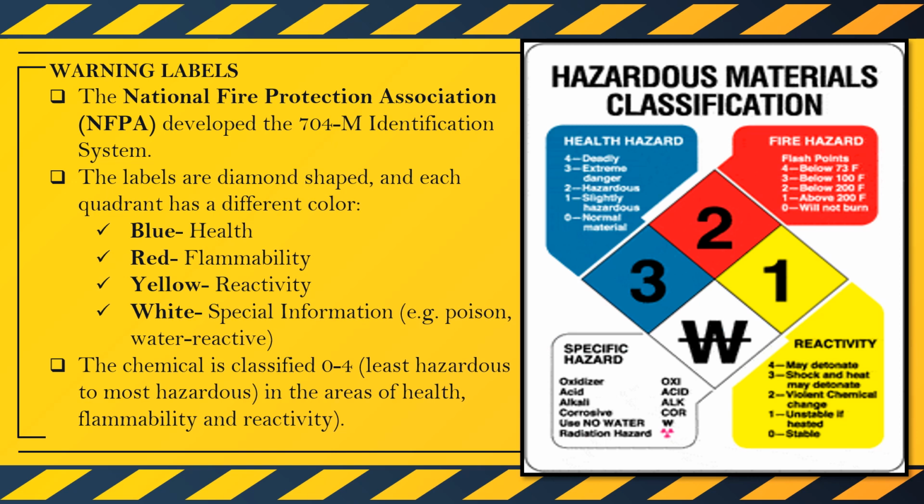And take note, class, I want you to remember that this symbol is not a substitute for proper handling and storage of hazardous materials. It is always important to follow proper safety protocols when working with potentially dangerous substances to, of course, minimize the risk of accidents and injuries when you are performing your duties inside the laboratory.